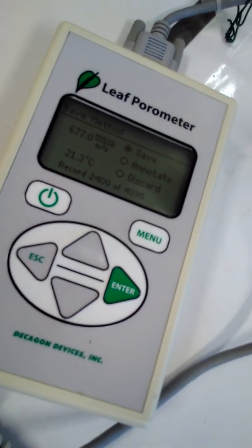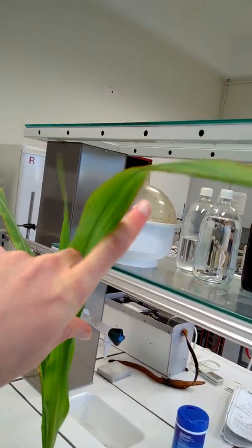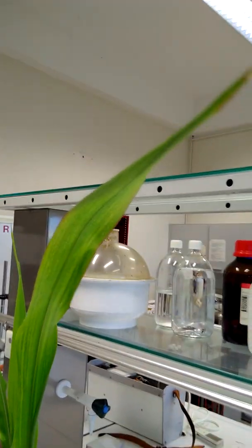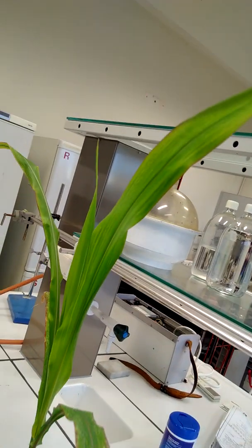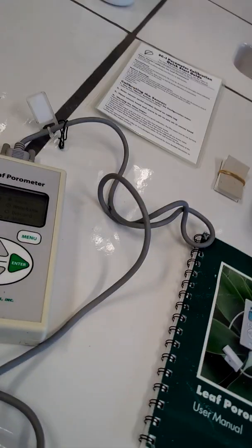But here in this room, the same temperature, because our leaf is not in the sun. In the outside environment, by the way, of course, leaves are often in the sun, and their temperature will often be higher, but not necessarily, it can also be lower, than that of the outside environment. And then you need to take that into account in the calculations. But in this case, in our room here, it's the same.